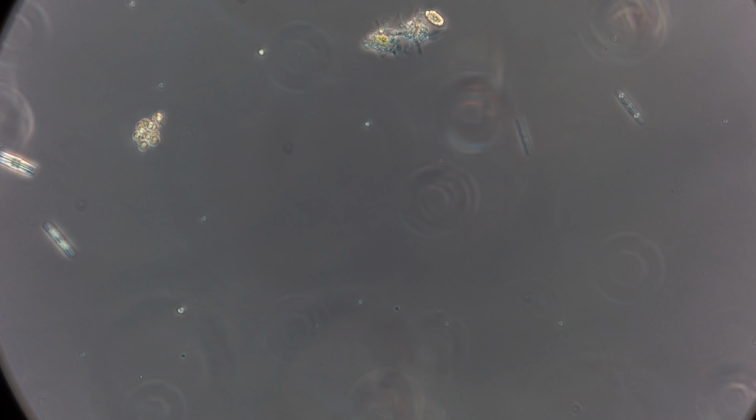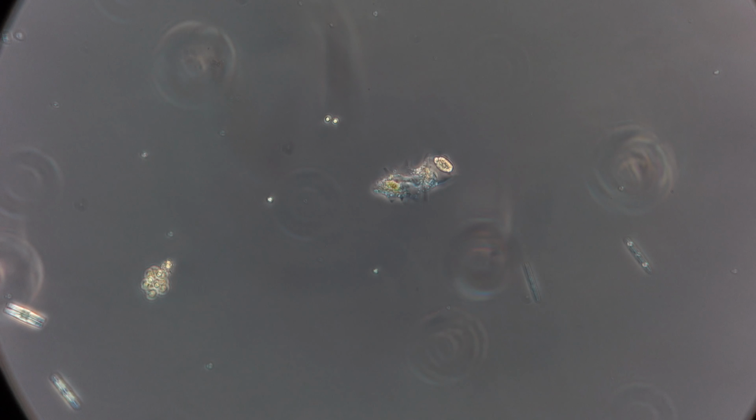Our amoeba's still going. Oh my god, is it gonna eat something? What? Oh my god. Okay, we're not gonna change the slide yet. I think it's gonna eat this. We're looking at the thing in the center, right? Yeah, the thing that died. Oh my god. It's so rare to actually see them eat something. Oh wait, it's actively eating it right now. Oh my god. It's exciting. And it's got a diatom inside of itself. It's eating a lot. Is the diatom what's in the back right? Yeah. Okay, we have to watch this for longer.